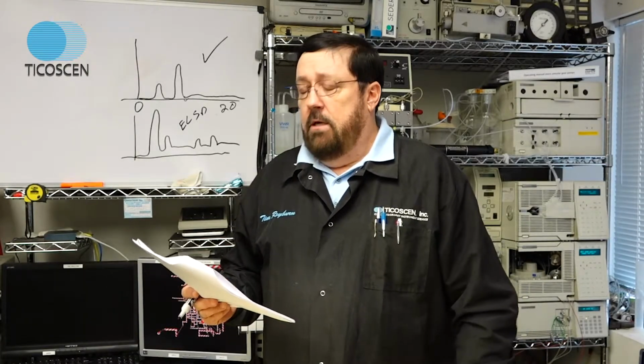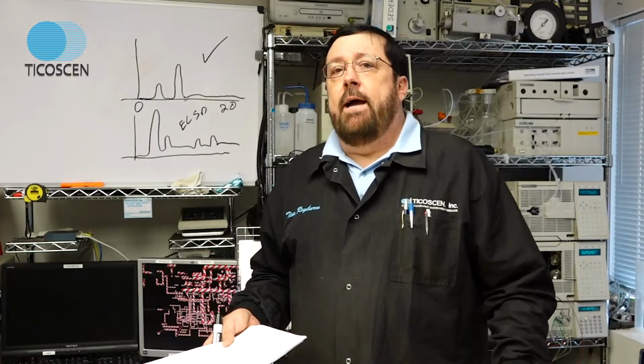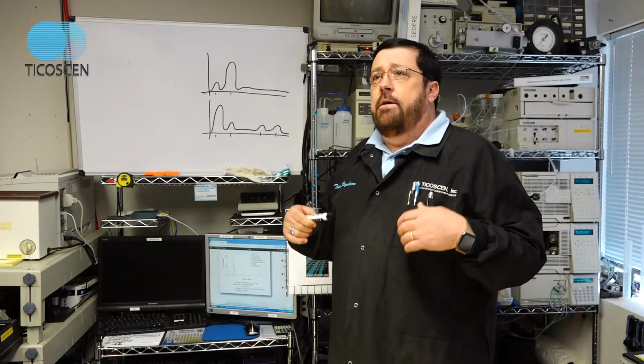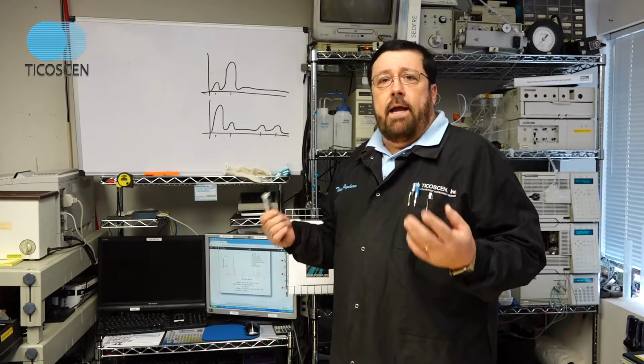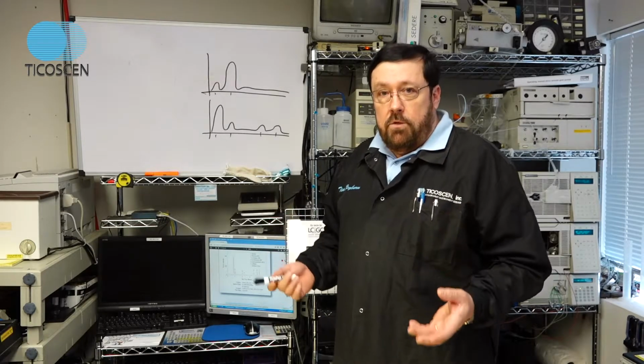Another example why ELSDs are excellent. They're excellent silica and turbidity detectors. If your nitrogen gas or your air supply is contaminated, the ELSD is going to see it. So ELSDs will see turbidity, they'll see silica bleed, they'll see dirty air. ELSDs will see everything. They're used to augment mass spectroscopy.